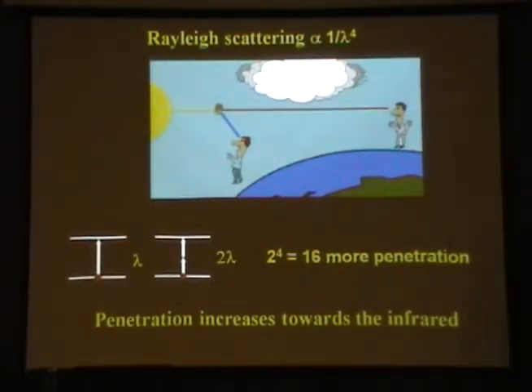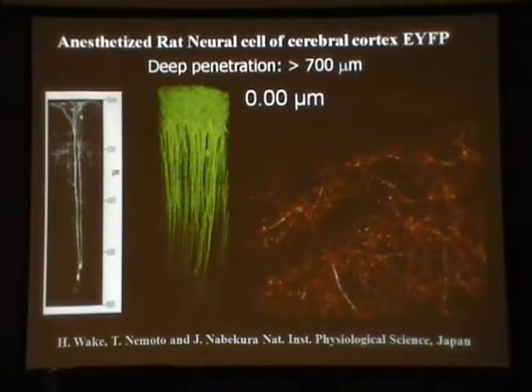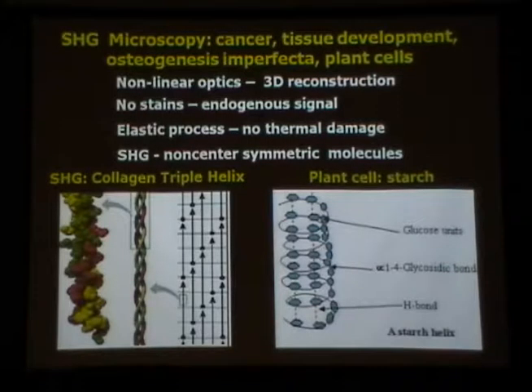The main advantage of multiphoton microscopy is the fact that if you go to the infrared, it's 16 times less scattered than with the visible one. So with that, that's not my measurement, that is the one that broke the record. The movie is not playing, but you can see here that it can reconstruct an image all the way to almost 900 microns, which is about 1 millimeter. In terms of optics, this is amazing that you can go down to 1 millimeter here and take the image at this depth.